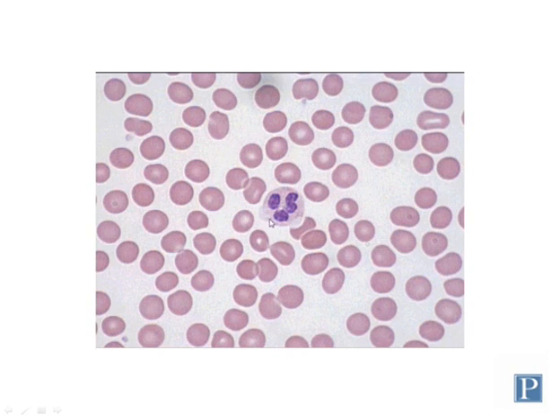They are often referred to as polymorphonuclear neutrophils because of the shape of the nucleus. And it might look like the cell has multiple nuclei. This is actually a single nucleus, but it has discrete lobes. On average, neutrophils have between 2 to 5 lobes to their nucleus. Most commonly, they have 3.